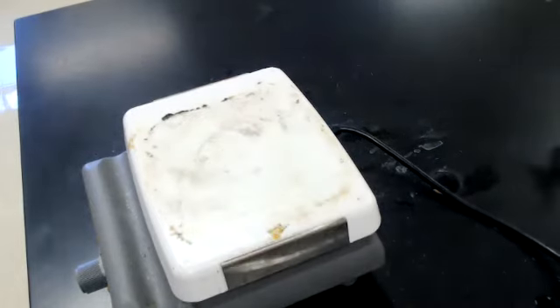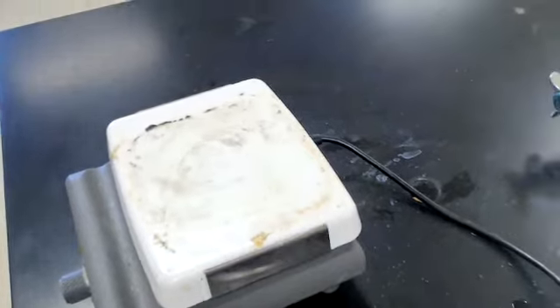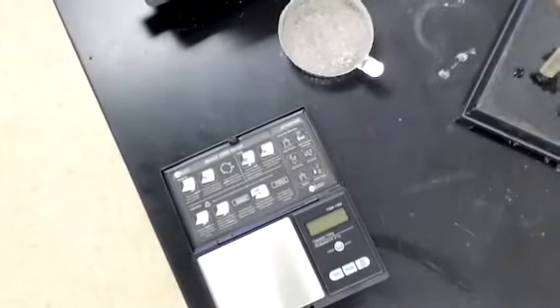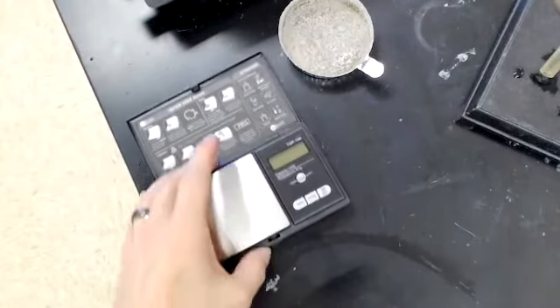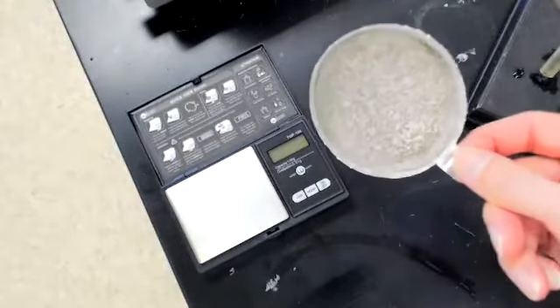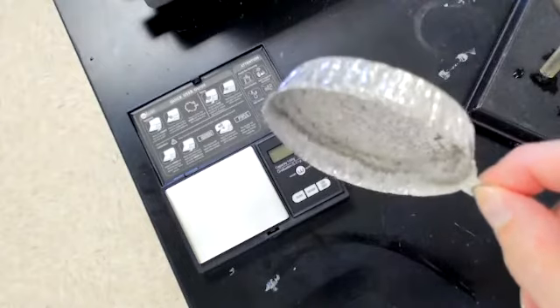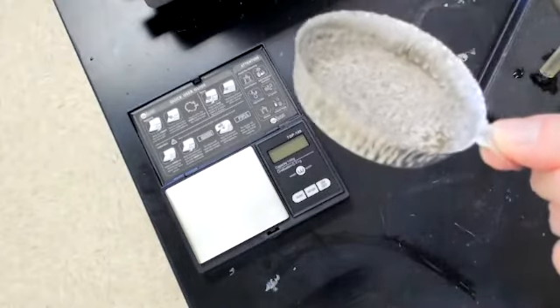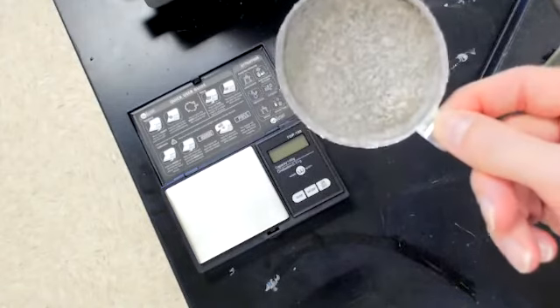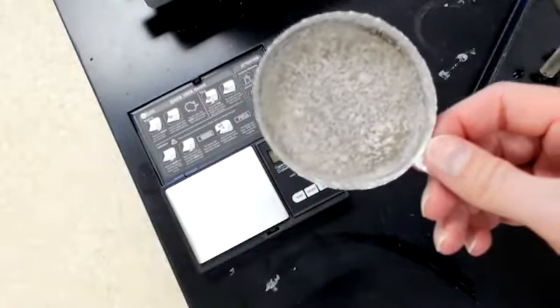I'm waiting for this to cool enough that I can put it on the electronic balance again to know its mass. How do I know when it's that cool? If I can touch it, it's cool enough to put on and find the mass of. So I'm literally just waiting until it is cool enough to touch. If you've not made observations yet, you might want to. I'm going to try and show you several sides of this. Make some observations. Okay, I can totally touch this. This is done. So now that's cool.